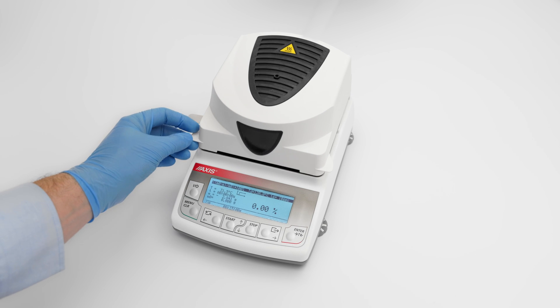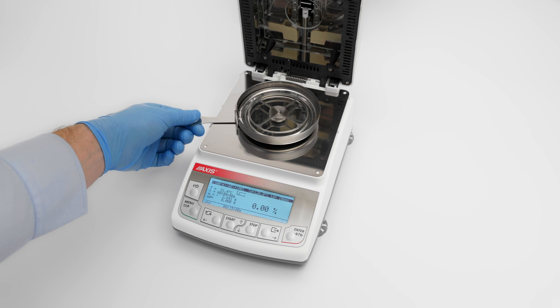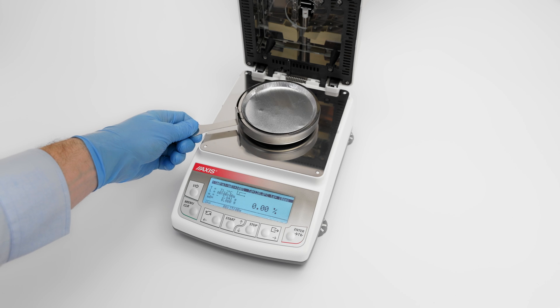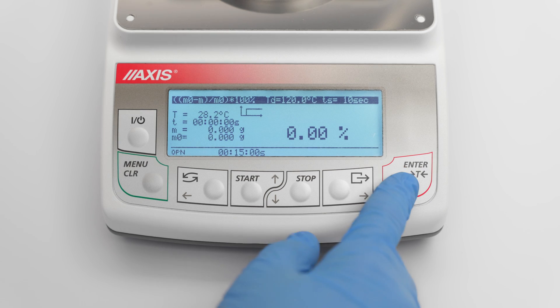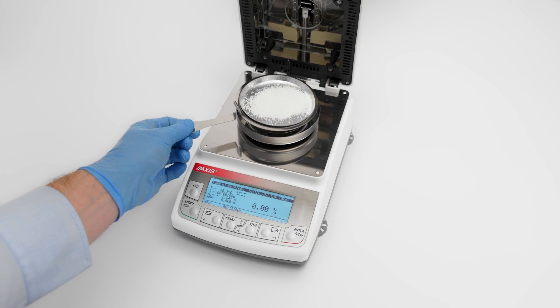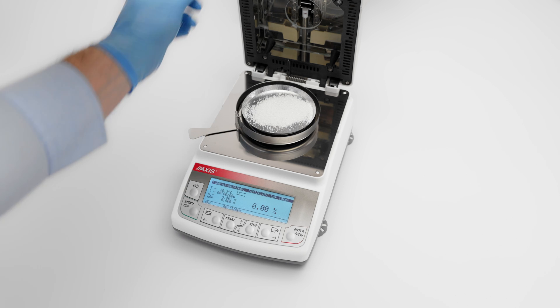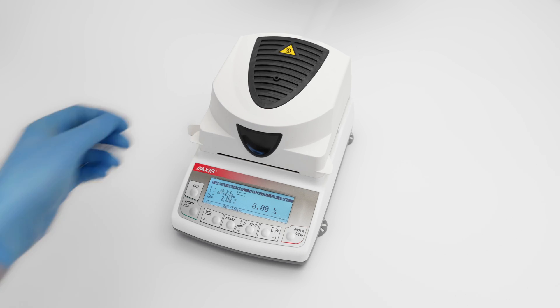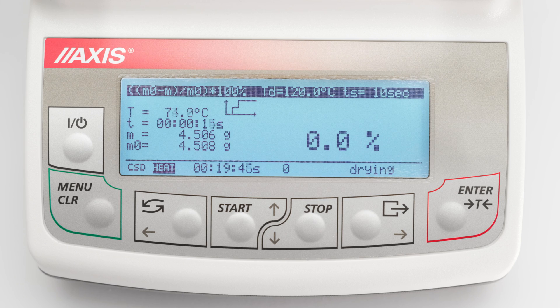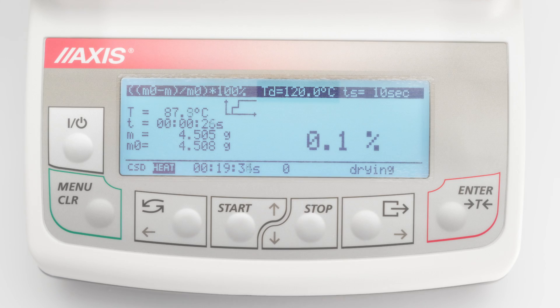After following the instructions from previous parts of the video, we can proceed to the actual measurement of humidity. Tare the moisture analyzer with an empty single-use pan by pressing the T key. Use the handle to place a pan with material sample and close the chamber. Start the measurement by selecting Start. The display during drying shows, among others, the following information: drying result — that is, humidity in percent — which changes continuously during the measurement, and the set drying temperature.